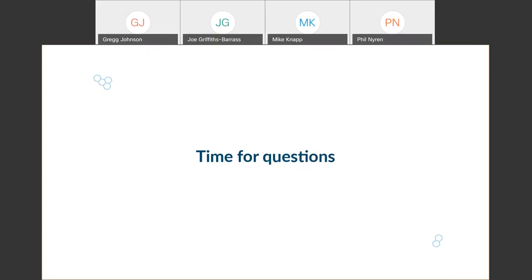Phil, I've got a question regarding the Masterflex Live. Someone's saying they've already got a few Masterflex drives, but they want to know, can the Masterflex Live capability be added to their existing pumps?